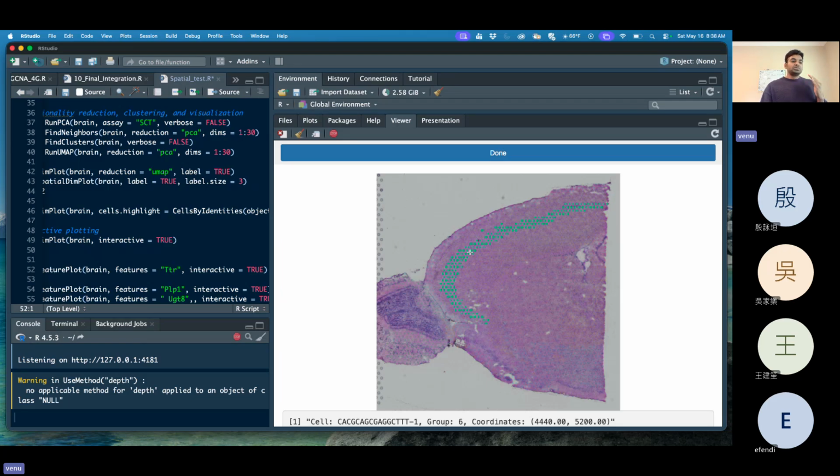In spatial, we have downstream analysis. We need to find the proportion of cell types within the spots. For suppose group 6, this barcode spot has 10 cell types. Out of 10, 7 are highly associated with epithelial cells, but there are also 3 cells that are maybe CD4 cells.